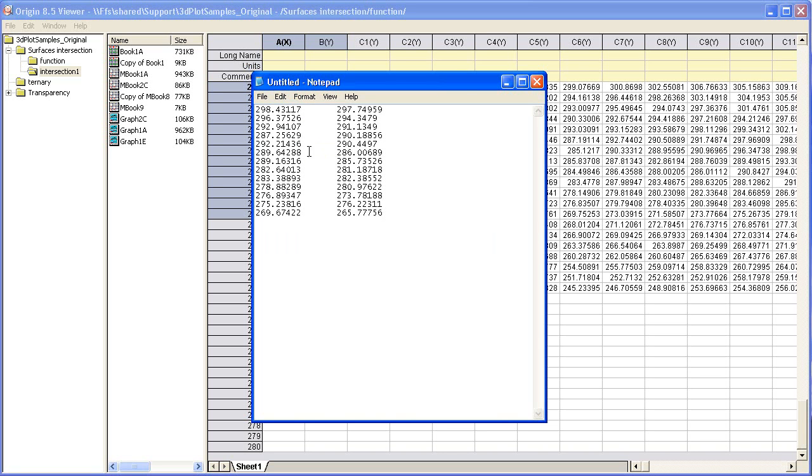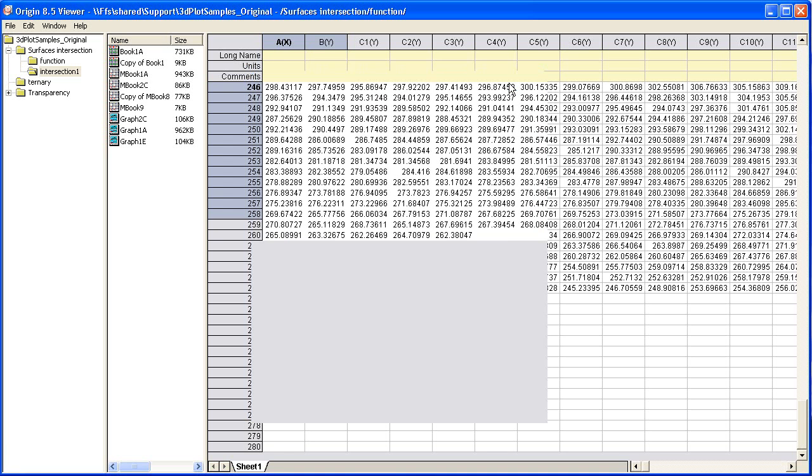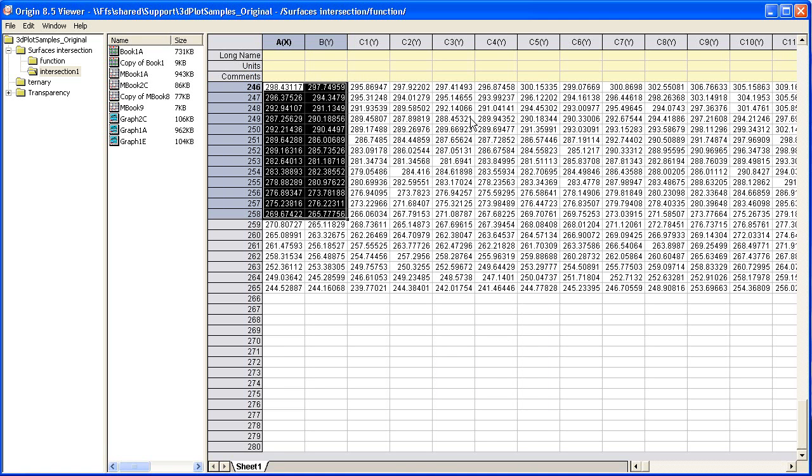Notice that when I had highlighted the data originally, there was the option to Copy Full Precision, which will copy all the digits that Origin is storing, not just displaying.